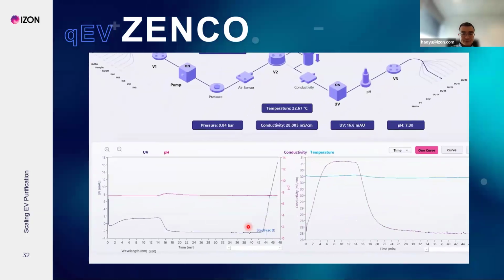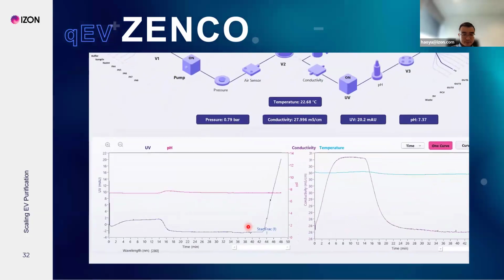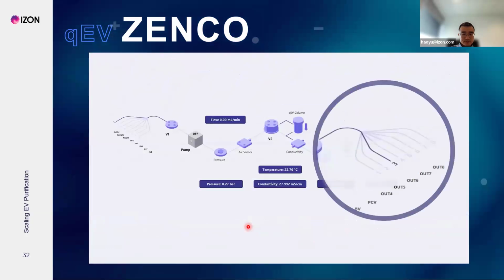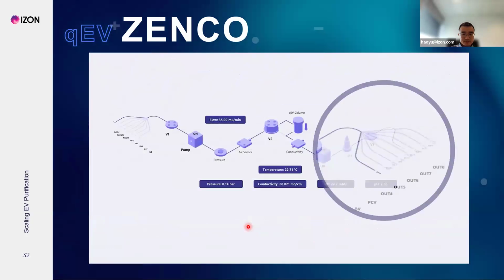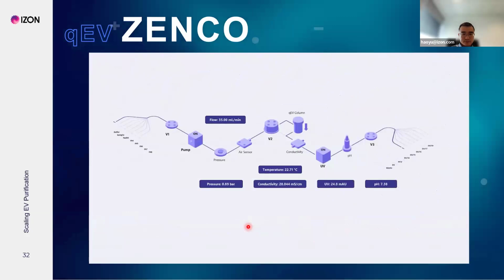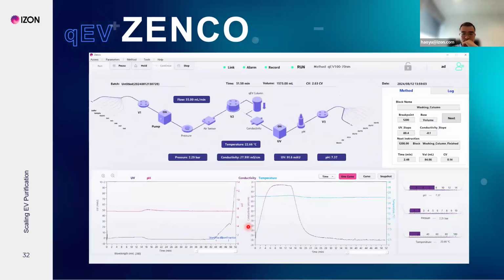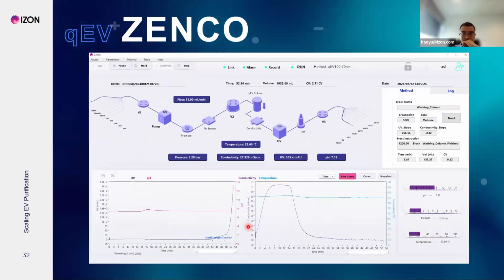volume in the method setup based on our analysis of previous elution profiles. The outlet will change from our collection vessel to waste based off what we established in the method development phase. You will notice there is a dramatic increase in the UV reading, indicating the proteins separated from the sample.